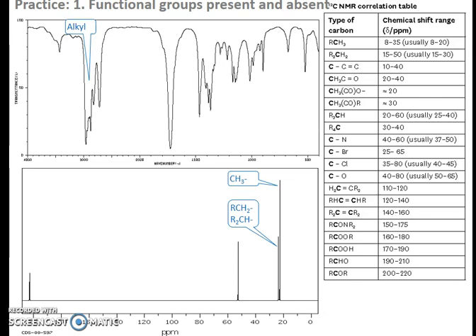So let's have a look at this systematically. The first thing we have is we obviously got some carbons and hydrogens. You can see that in the IR spectrum, we've got that ugly looking spiky peak that represents the carbon hydrogen bonds. And similarly, in the NMR spectrum, we can see those two peaks both at around about 20 to 25 ppm, which represent CH3s and CH2s.